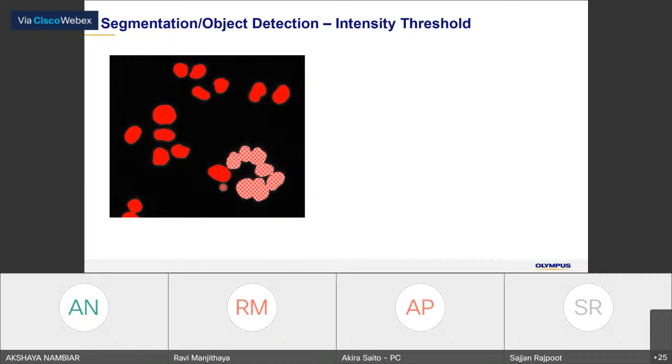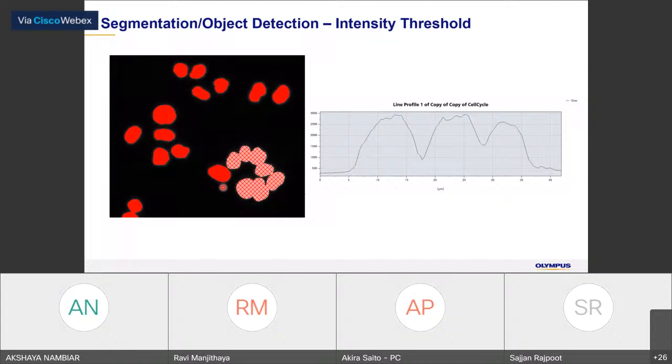To go further, to do proper segmentation, there is one method called watershed. There is an algorithm to detect the peaks and gaps, and give a division in the gap.